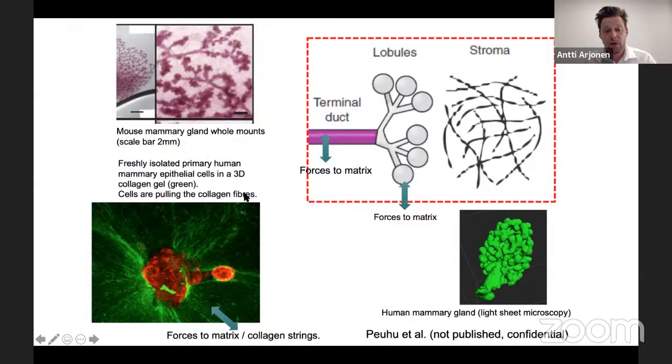For example, here we simply took the image data, replicated it and printed it. The idea behind this study is to get the cell lines in their correct format replicated by a robot, the 3D printer, and see how well they cope and how well they interact with the fibers produced.